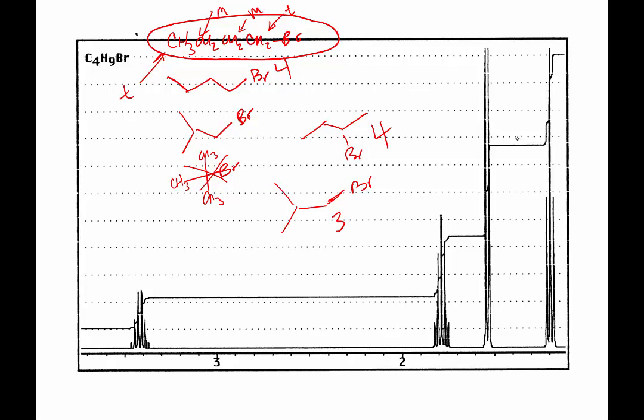And you can match up the spectrum. But it's not good enough just to match up the spectrum. What you've got to do is not only, if I give you compounds, match them up with the spectrum, but you then have to tell me what peak corresponds to what set of hydrogens in that spectrum.